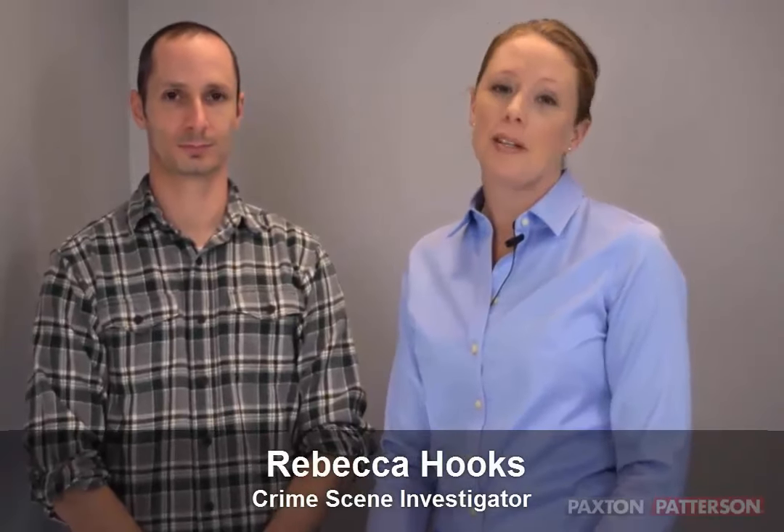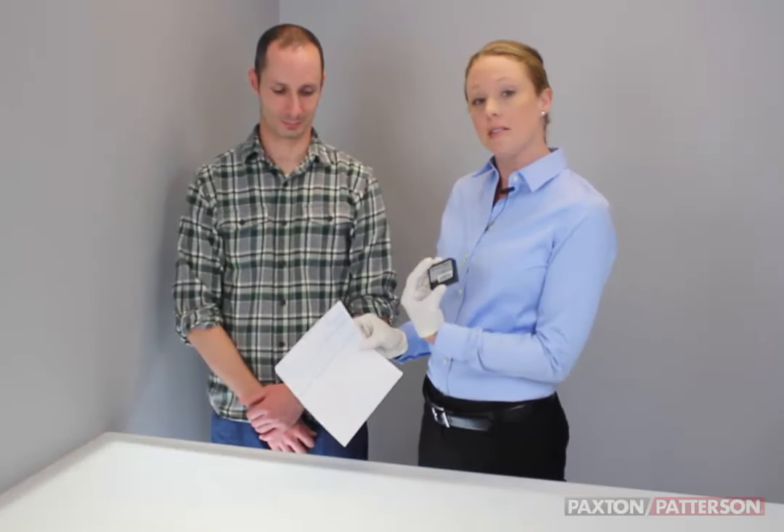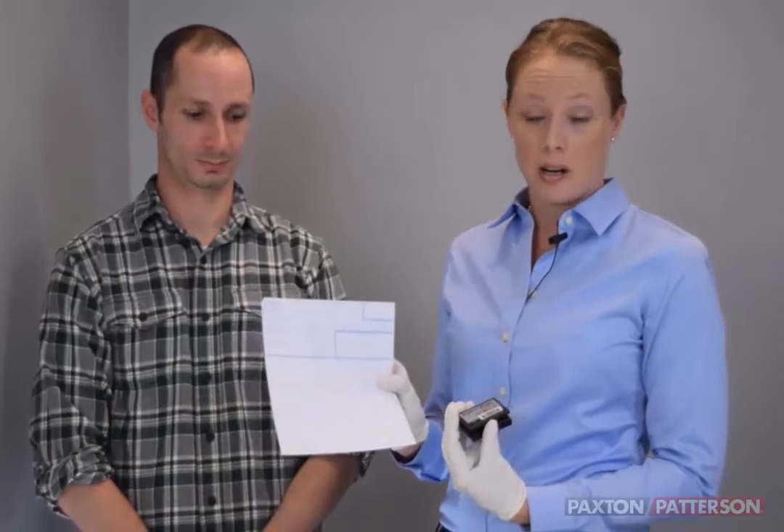For today's activity, I'm going to be teaching you how to fingerprint someone. Brandon is going to be helping us out. I'm going to be placing his inked fingerprints on a 10-print card.